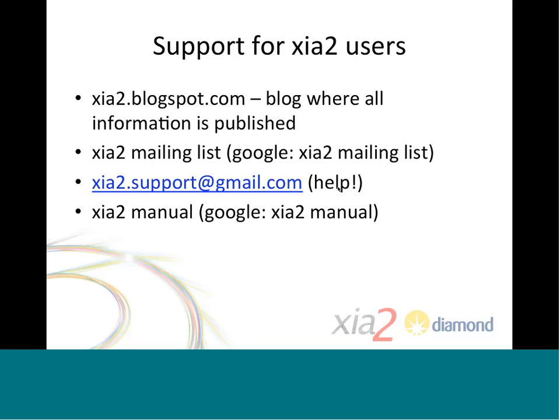Adding in the correlation coefficient-based resolution limit determination is on my to-do list, based on what Phil Evans and Kay Diederichs and a few others say. That should be done, but it isn't currently done. Does that answer your question? If not, the user can go ahead and chat me again, and we'll try again.